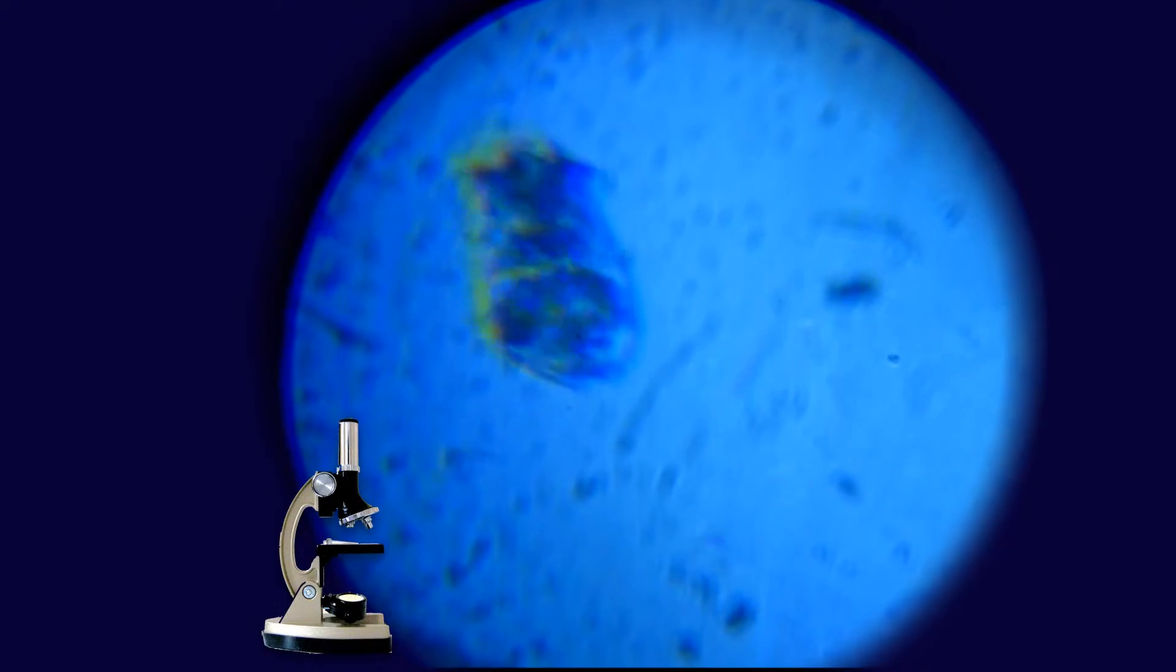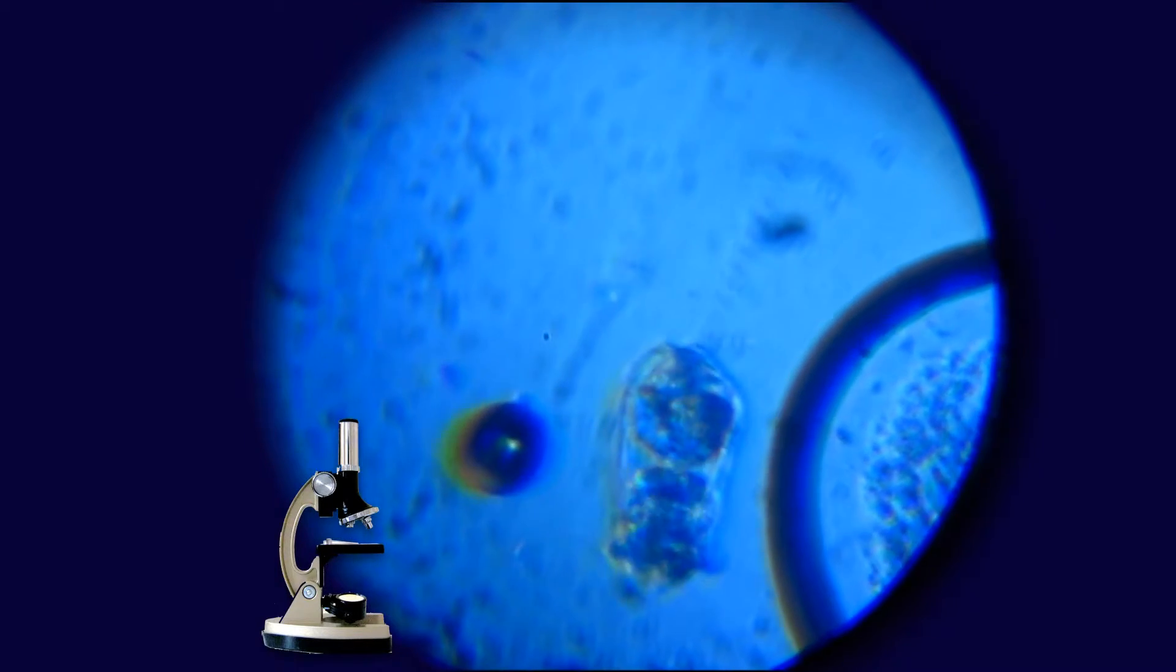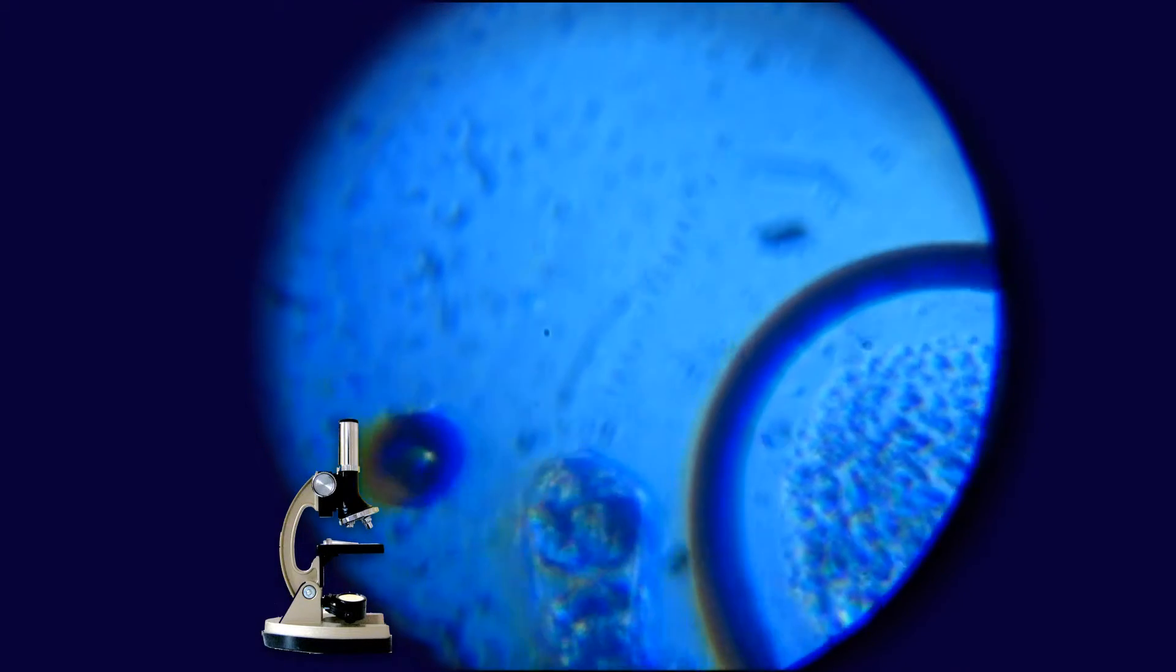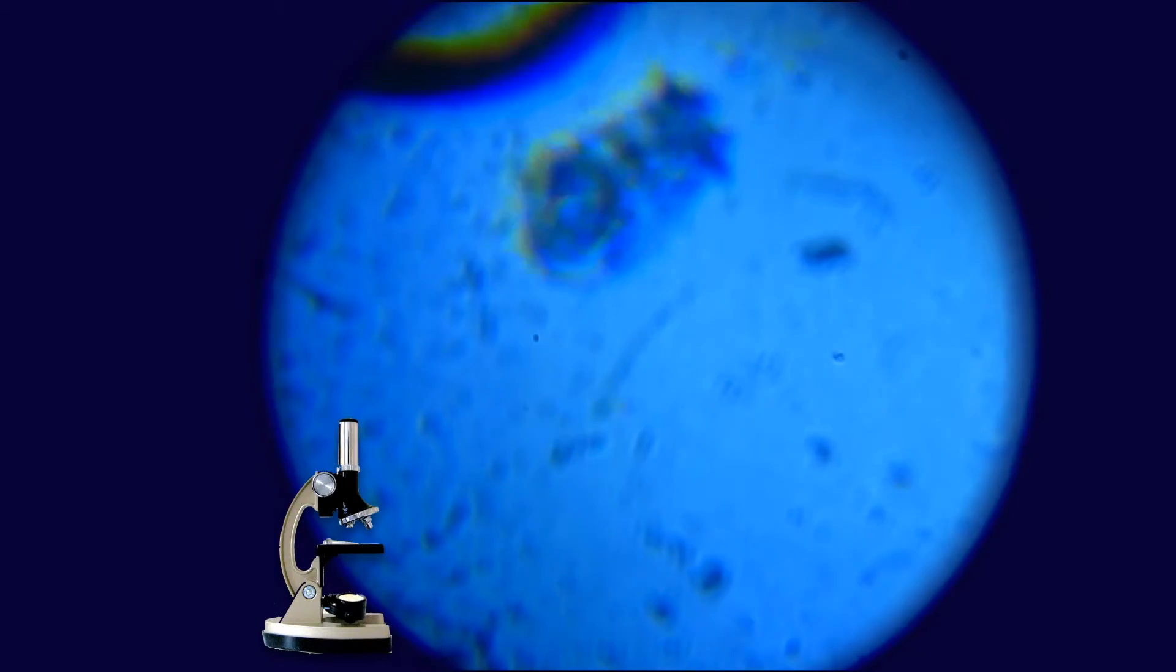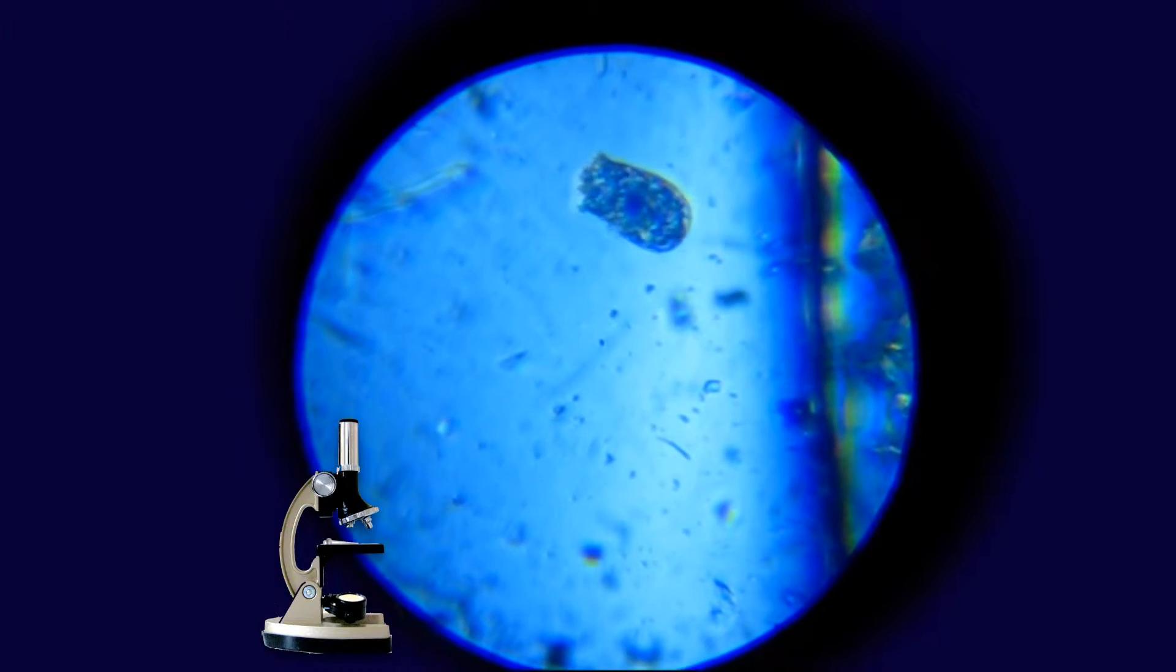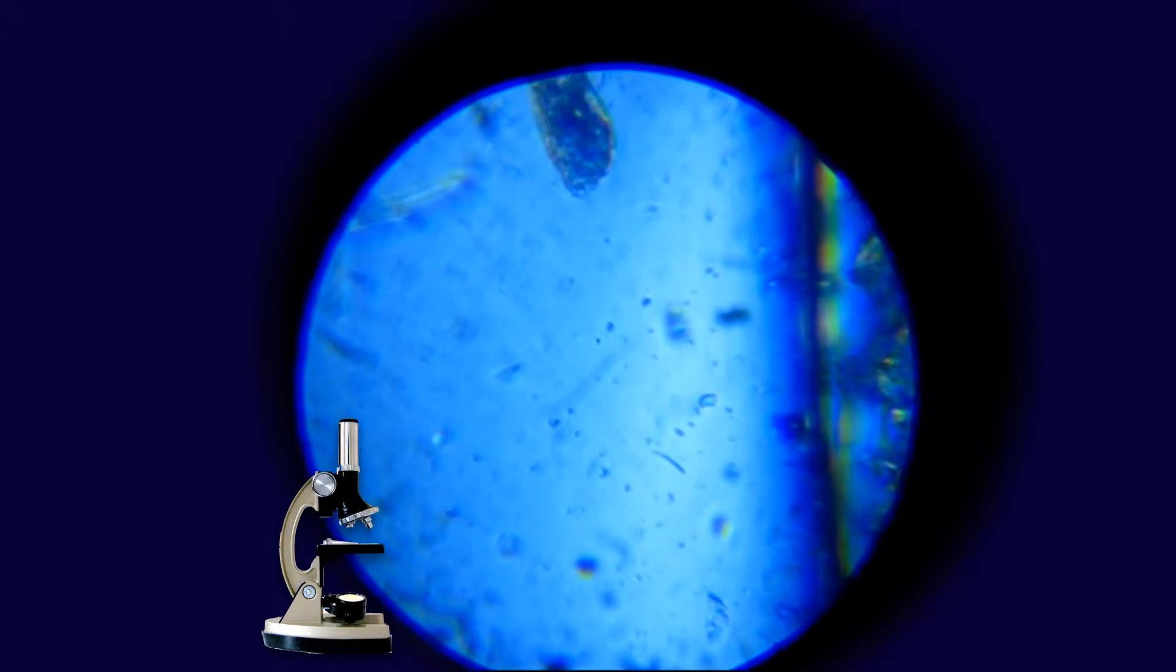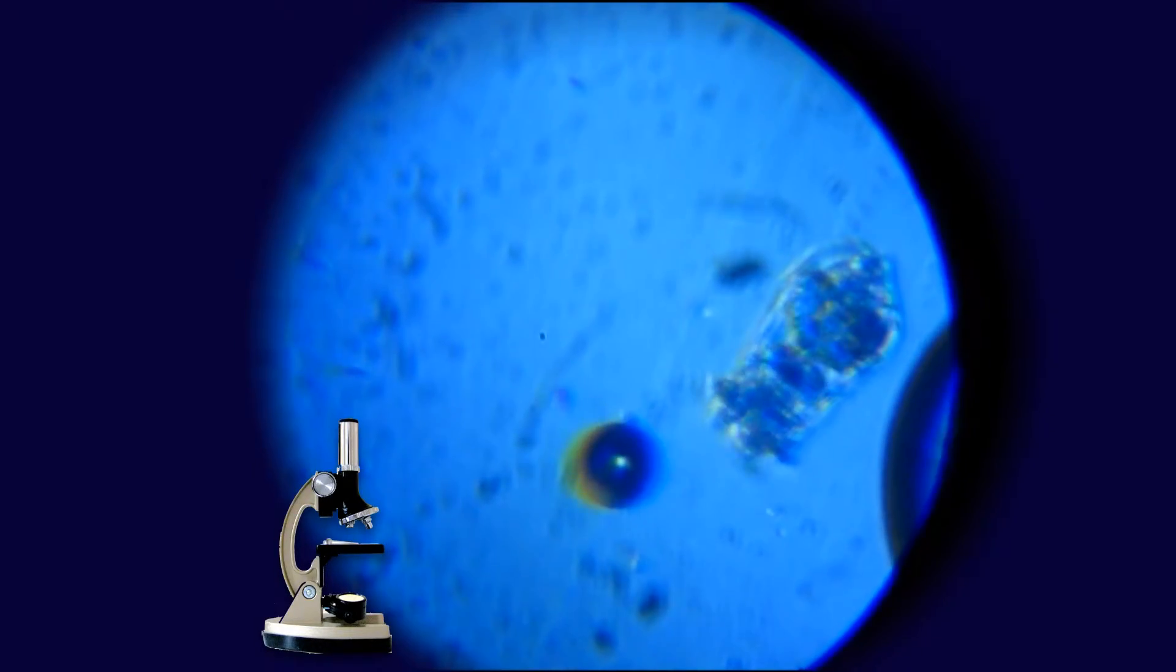Wow. Isn't it crazy to think that in a drop of water that looks just, well you can't see anything in it, there are actual animals swimming around that are so small you would never know they were there. Yet with a microscope you can look at them. Look, you can see their insides moving. They're just completely see-through.